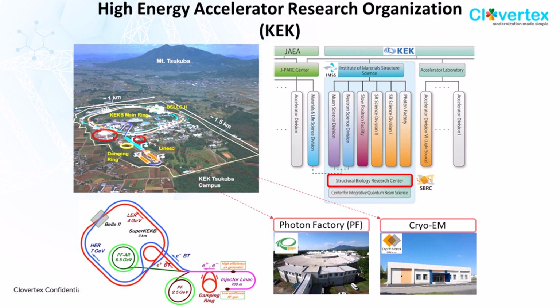We have two major facilities. One is the Photon Factory. This is the original facility that we are running, supporting all the Japanese researchers who are doing X-ray crystallography and SAXS, small angle X-ray scattering.